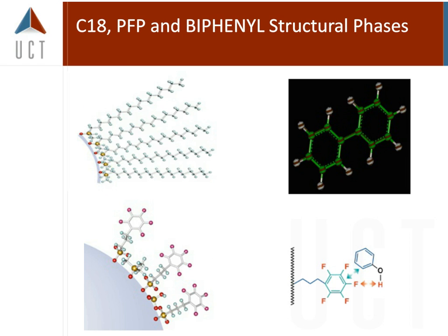So again, the next slide is another diagram for looking at some of the different aliphatic and aromatic structures. Here you see biphenyl as well as your polyfluorinated phenyl columns. And notice there on the lower right-hand side where you'll see that there's hydrogen bonding. Some of the general chemistries that we use are important, maybe understanding what's going on in our extractions and our chromatography. So what I'd like to do then is to continue on and just make sure we stay with some of the general ideas. And let's not forget about aromaticity, aliphatic compounds, and what are these attractive forces?